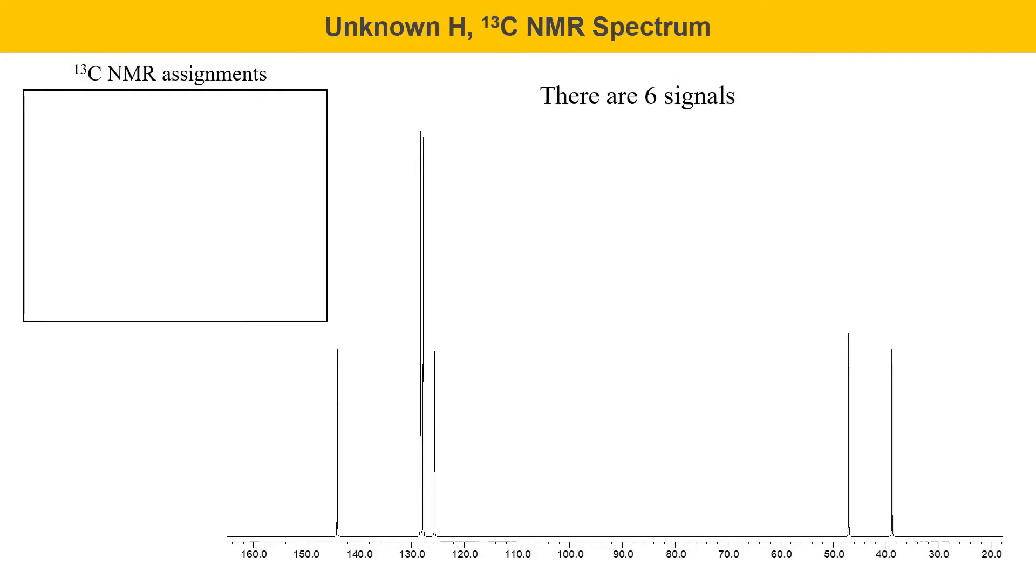The carbon-13 NMR for unknown H is shown here. There are a couple really fine lines here at around 128, and there's a total of six signals in this particular spectrum. So there are six unique carbon types in this molecule.